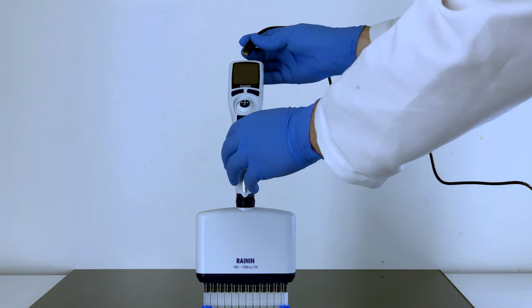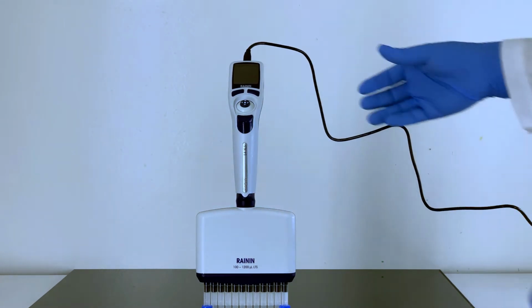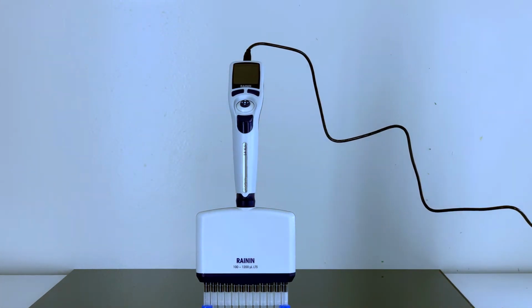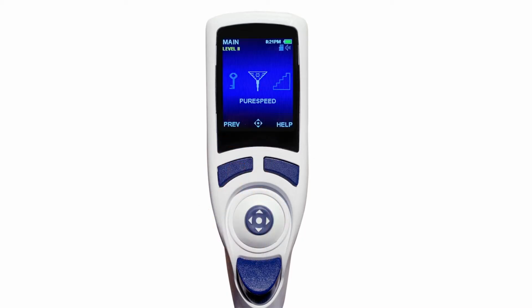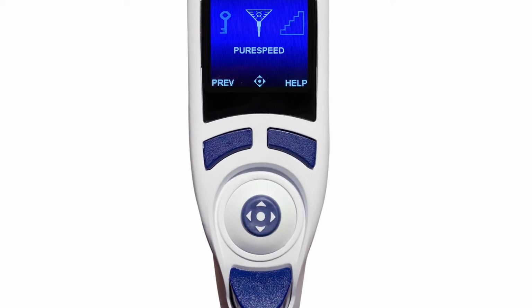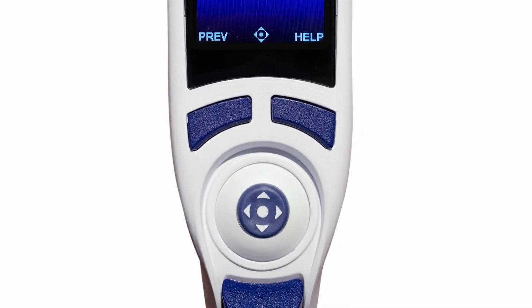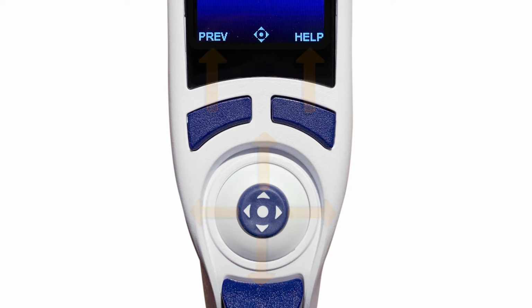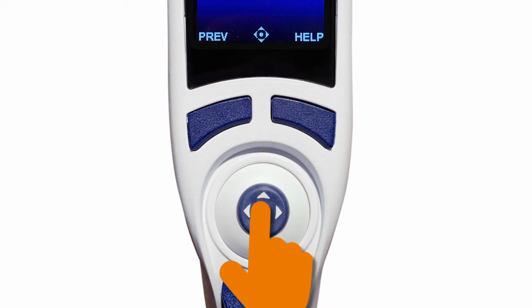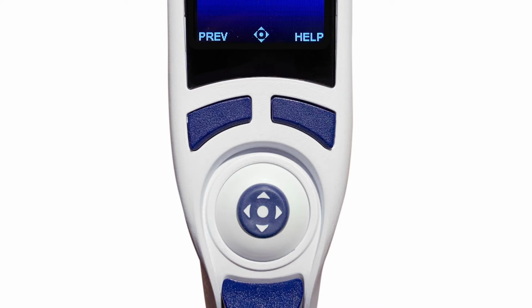Plug in the pipette power adapter to a power source to ensure your system does not run out of power during your preps. Turn your pipette on by pressing one of the keys under the display. There are 3 controls on your pipette. The top buttons correspond to the appropriate commands on the screen, and the joystick has up, down, left, and right controls. Additionally, the joystick has an enter option by pressing down on the circle symbol.